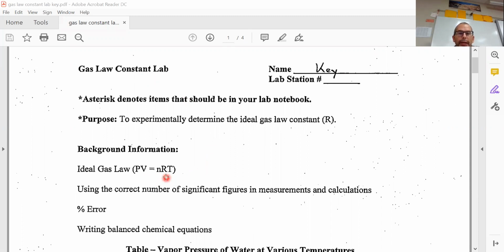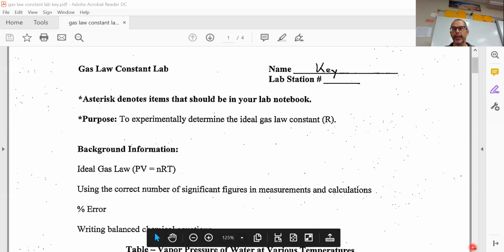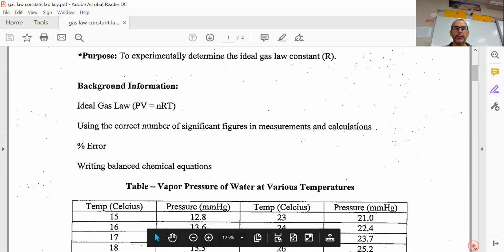So we're trying to solve for the gas law constant, which is R. And really, the way to do this would be testing a lot of different gases under a lot of different conditions. We're going to test one gas under one condition, so I don't think we're going to prove anything, but at least we can verify that getting this R makes sense if we can get pretty accurate results, especially class-wide. So I'm going to just scroll through this.